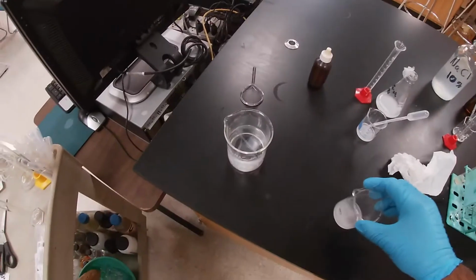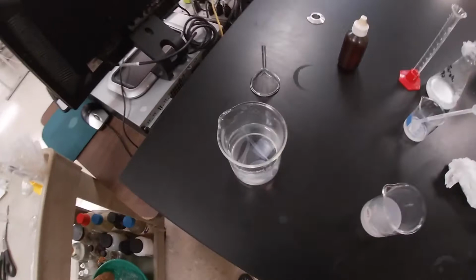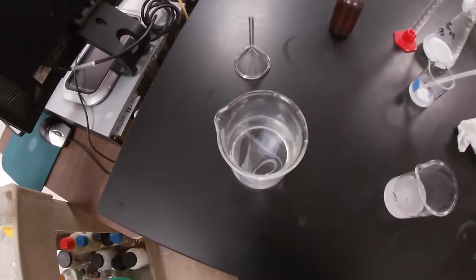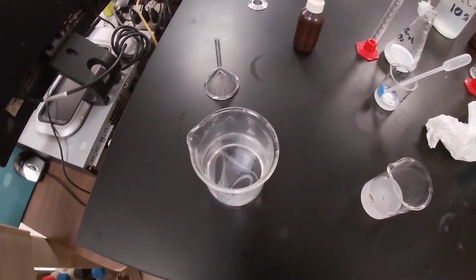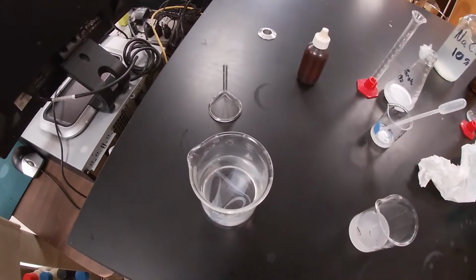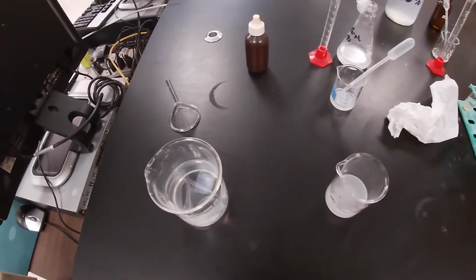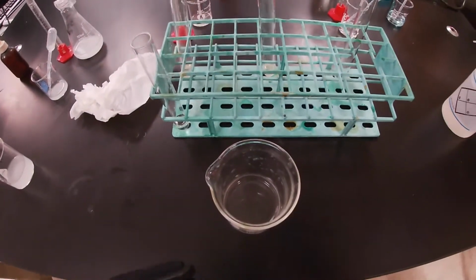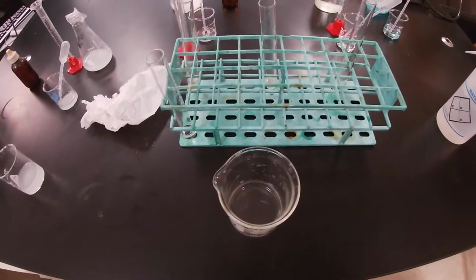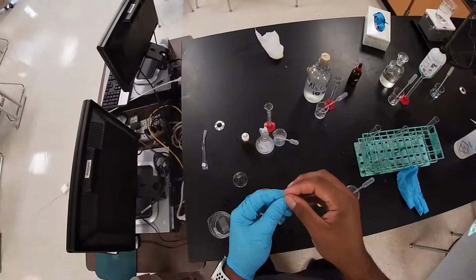And the next thing we're gonna do is get our dialysis tubing. And this is where it's located, it's in water. And then what I'm gonna do now is remove the tubing, make a knot, add 20 milliliters using the funnel, okay? And then tie the top, and then we're gonna place it in a 250 milliliter beaker, and then we're gonna submerge it in water, and then I'm gonna take the first reading of all those three, okay? So let's get that ready.